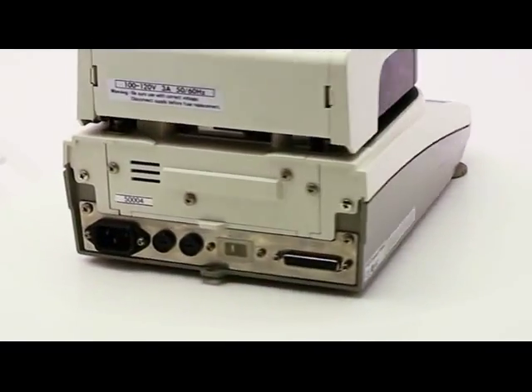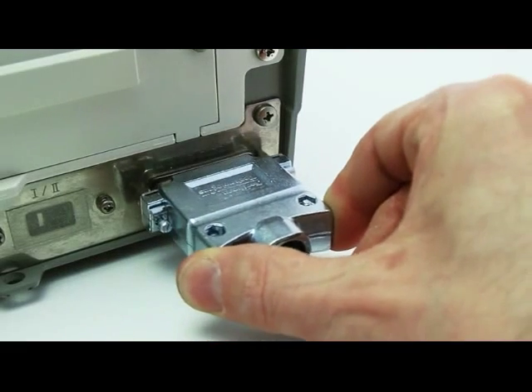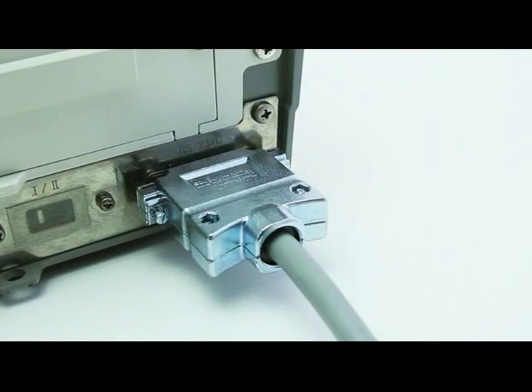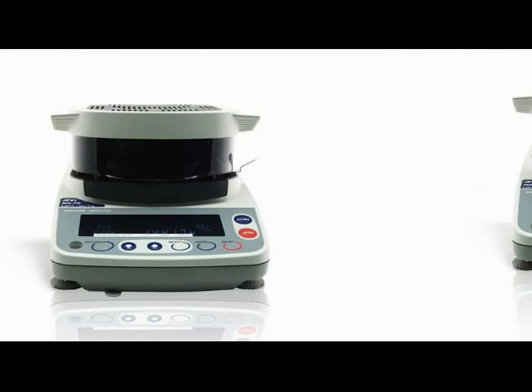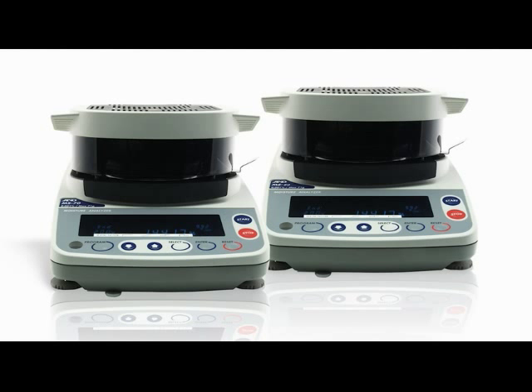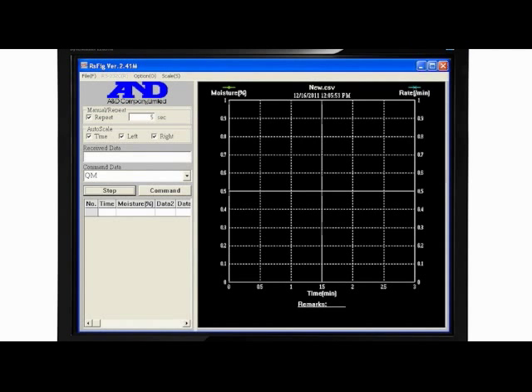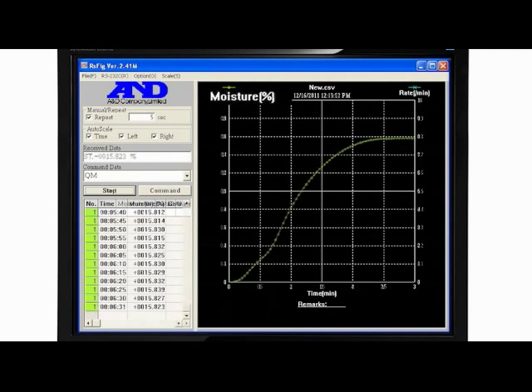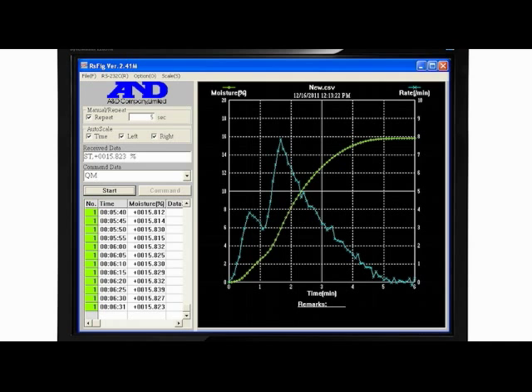Computer control and data export are easy with built-in RS-232. With the MS-70 and MX-50 you also get A&D's WinCT moisture software which displays both moisture and moisture rate changes over time.